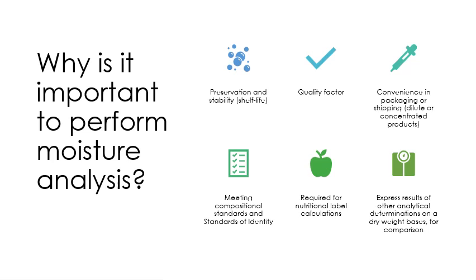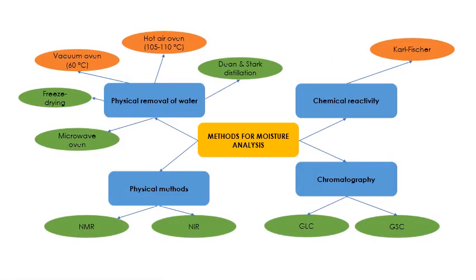We also need to perform moisture analysis for the proximate analysis. This is required for the nutritional labeling, for the nutritional label calculation. And lastly, it is for you to express results of other analytical determinations on a dry weight basis. This is for comparison.